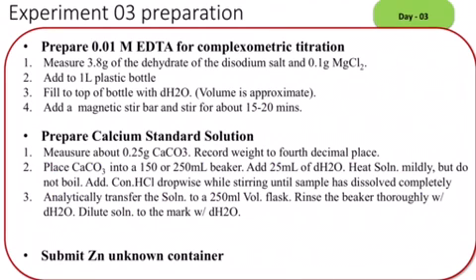In day 3 of experiment 2, you also need to prepare 2 solutions you will need for experiment 3. So, prepare an EDTA solution and a calcium standard solution. Also, please submit a zinc unknown container to your TA for experiment 3.